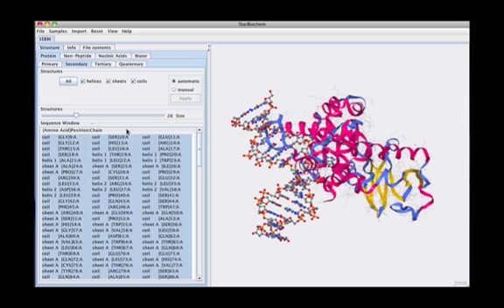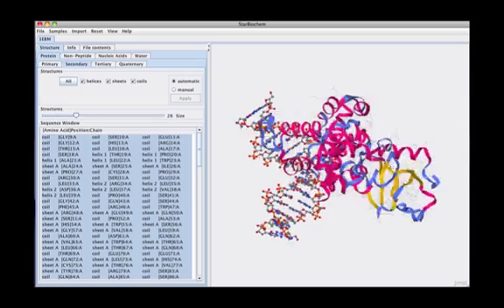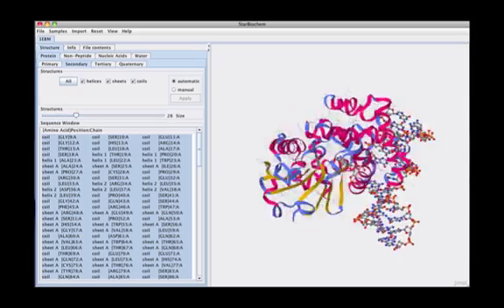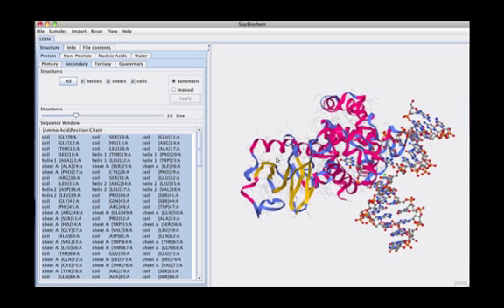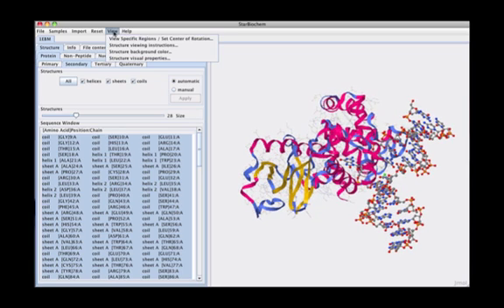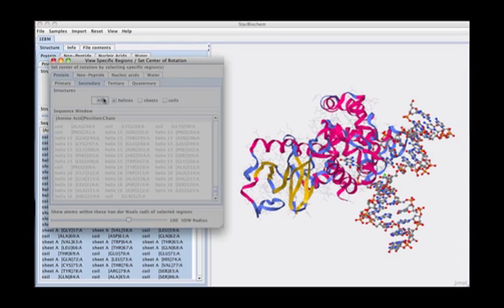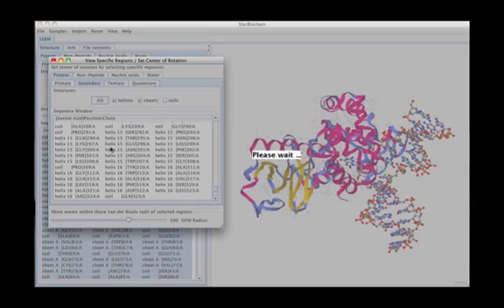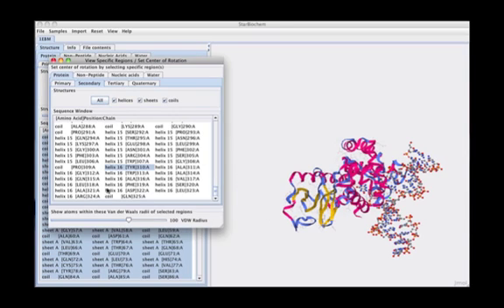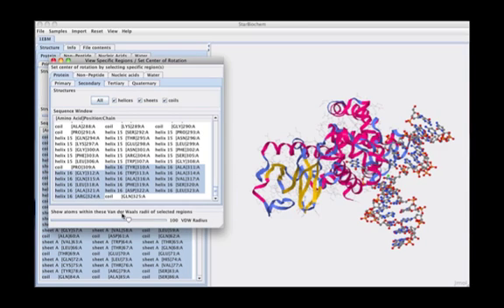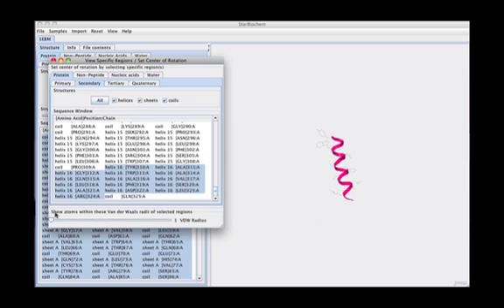In aggregate or by themselves. To isolate a structural component, click on select view specific regions where a specific structure such as helix-16 can be selected and the atoms around helix-16 can be obscured.